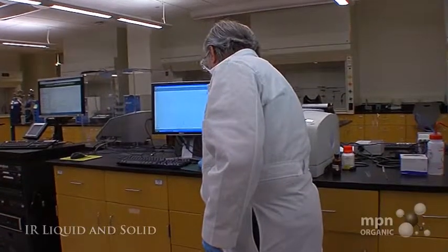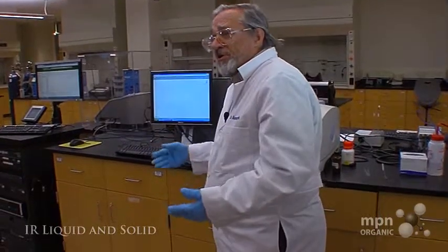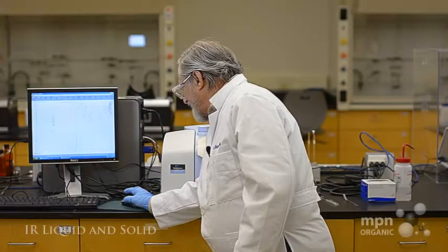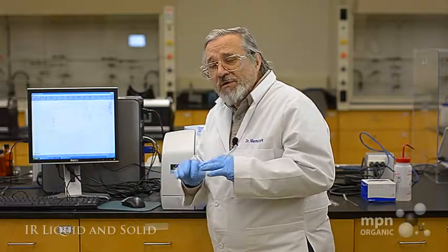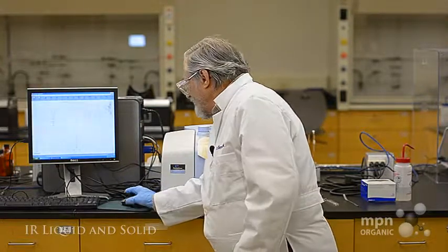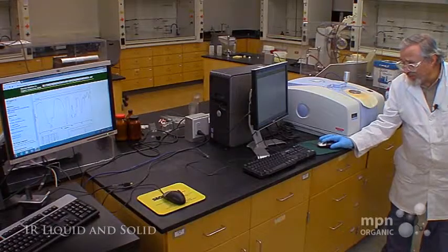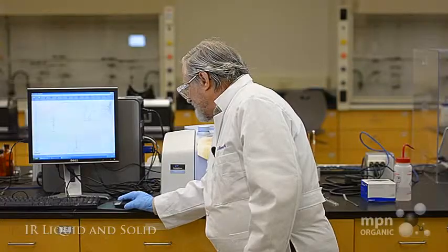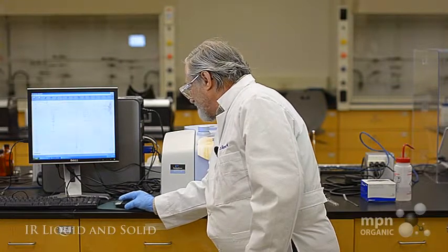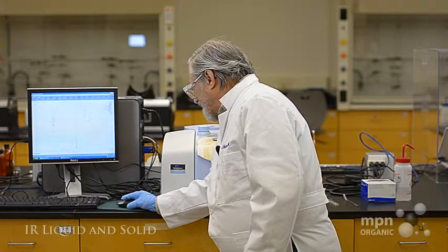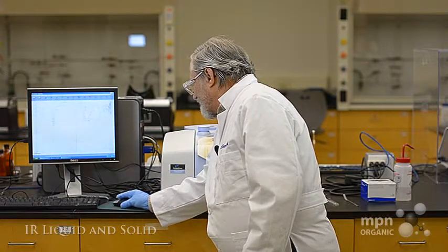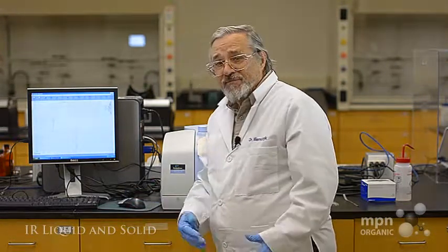And then we're going to determine what the peaks are. So this is going to peak pick, and we're going to set that at such a level that we get all the main peaks in the infrared spectrum. And you can see right here that it's a carboxylic acid. There's the OH stretch right there. There's a carbon-oxygen double bond. And there is a lot of interesting stuff for an IR spectroscopist, but not for us.